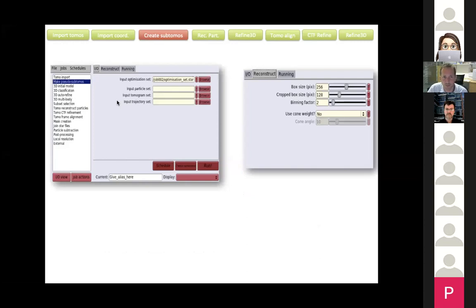Now, then you generate these pseudo sub-tomograms from the aligned tilt series images. So this will basically read in the tilt series images and then take the relevant areas for each of the particles and the relative CTF, taking into account at what height in Z in the tomogram you are, etc. But you do need for this three-dimensional picked coordinates in some raw tomogram that you've made in that third-party software. That could, however, be in a downsampled file, which would be less big than the full resolution.